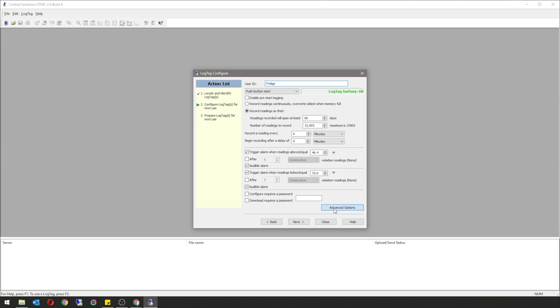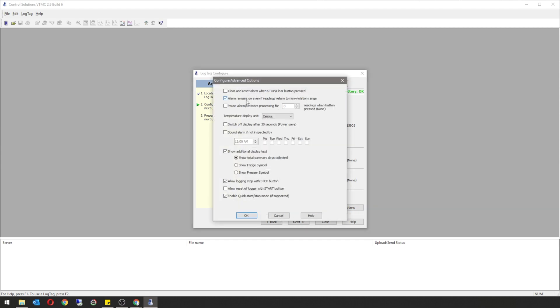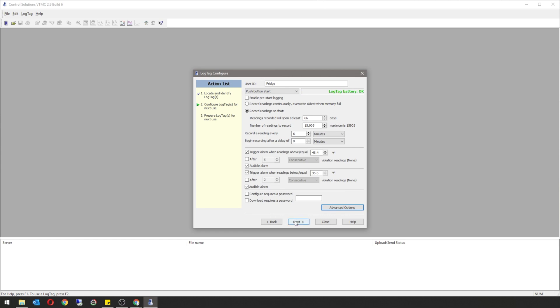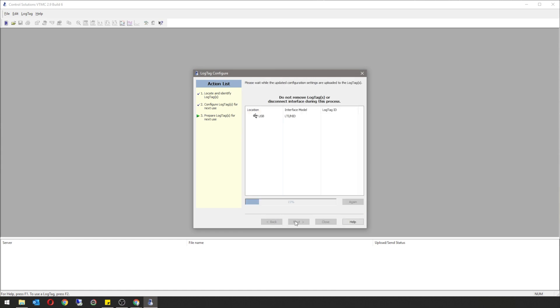Select Advanced Options. You're going to have alarm remains on if reading returns to non-violation range. Select your temperature display unit to be in Celsius or Fahrenheit. Show additional display text, show total summary of days collected, allow logging to stop with stop button, and enable the quick start. Press OK and then hit next. Once the configuration goes through to 100% and you see a green arrow on prepare logs for next use, your data logger has been configured. Hit close.